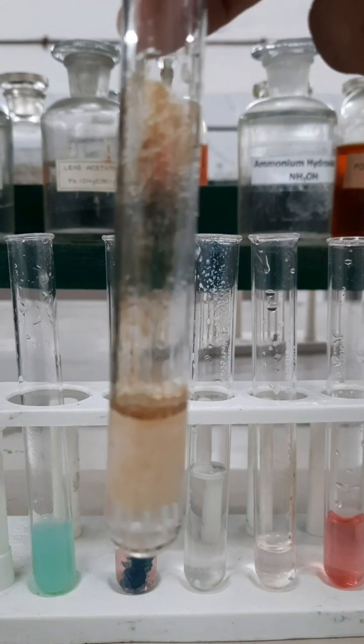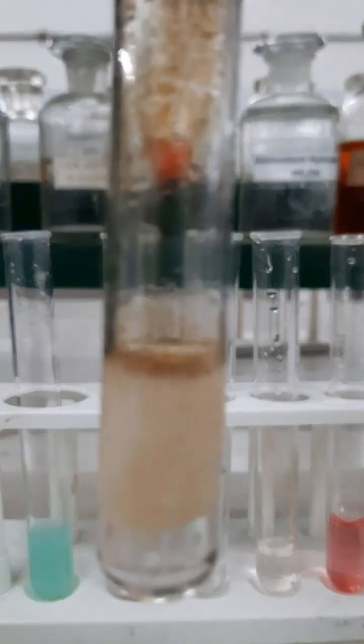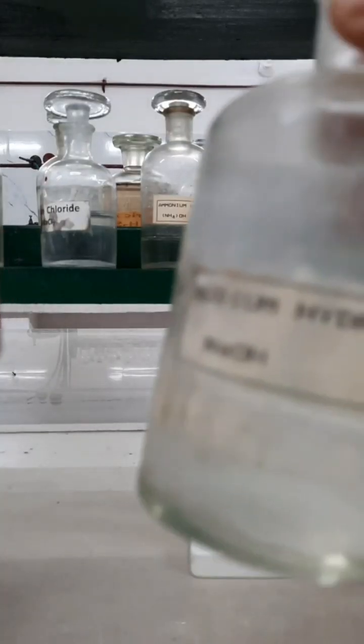And in this way we have seen how fourth group cations react with sodium hydroxide solution.